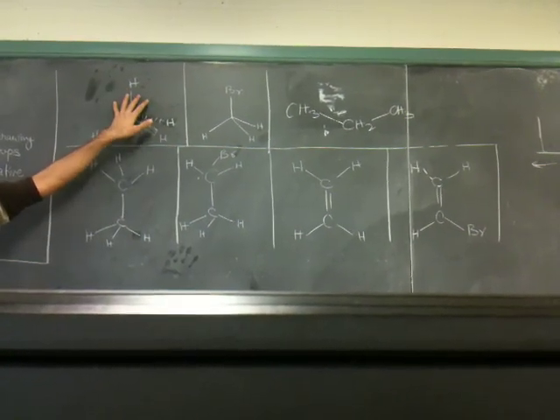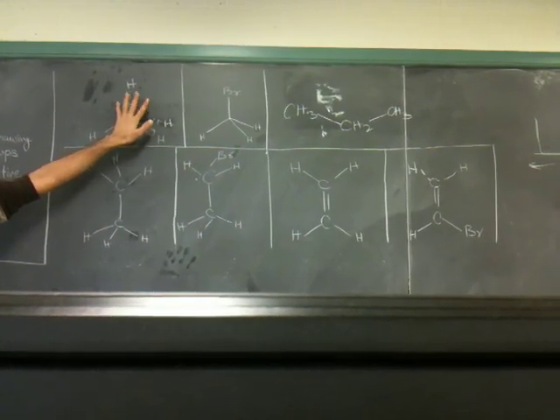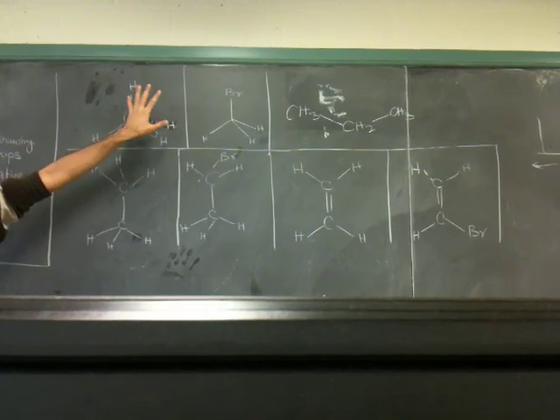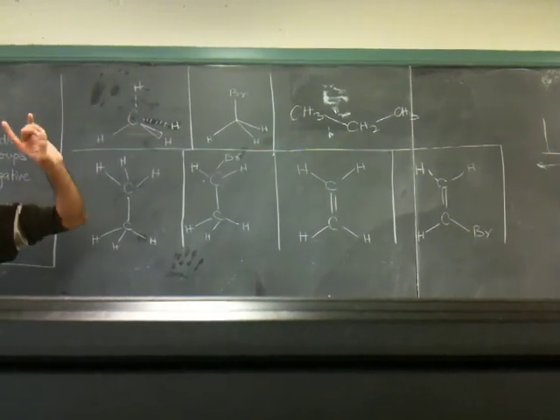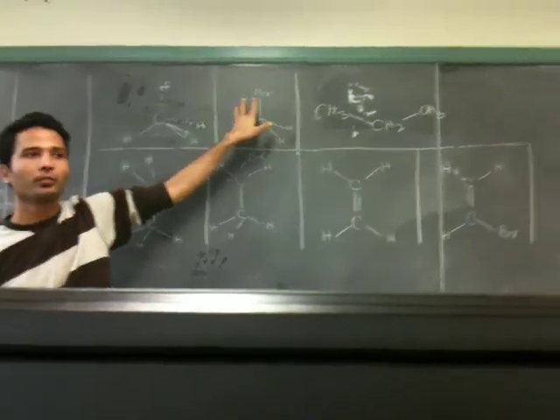Unfortunately, this one is a gas. It will be hard to grab this and get the spectrum of it. I just wanted to give you an idea of a particular set, or the chemical environment. So let's move on to the second example here.